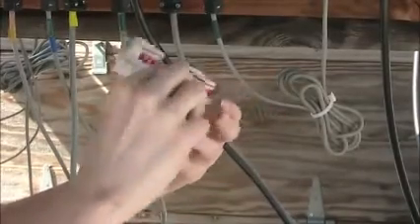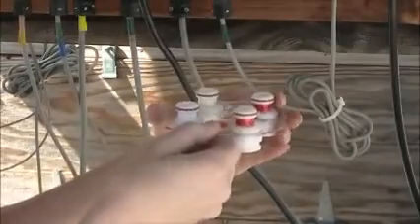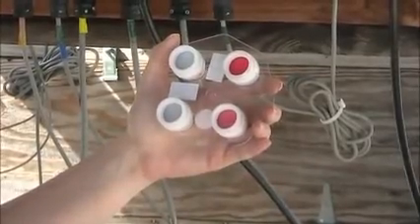Cassettes in the cartridge that have stickers or neckties should contain filters. Cassettes that do not have stickers should have dummies loaded in them. Dummies are pieces of paper and thin plastic used to block the flow of air.